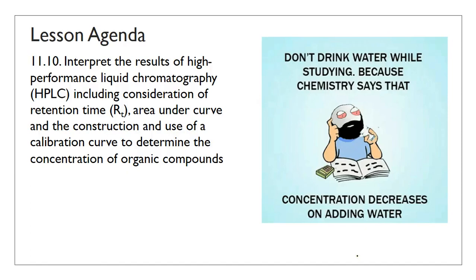Welcome back. In this video, I will be discussing dot point 11.10, which looks at the interpretation of the results in mainly HPLC, but I'll spend some time talking about paper chromatography as well.